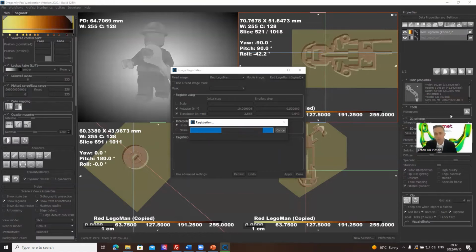So we can use that clipping box to crop the data as well. You can also use other tools to crop data, for example, shape tools, which I think I need to show. But if I don't show it in this video, I will definitely show it in one of the next ones.